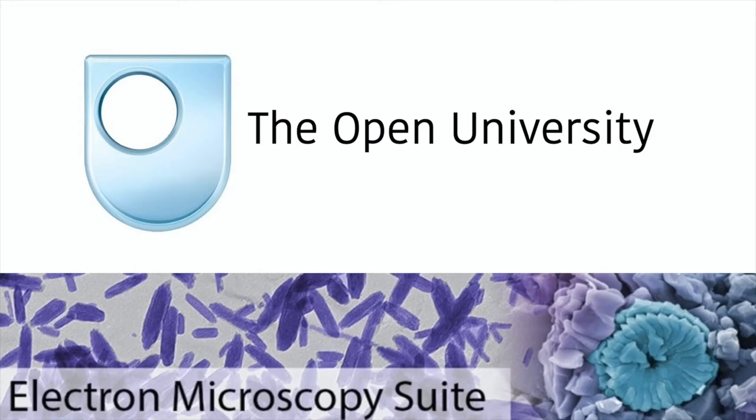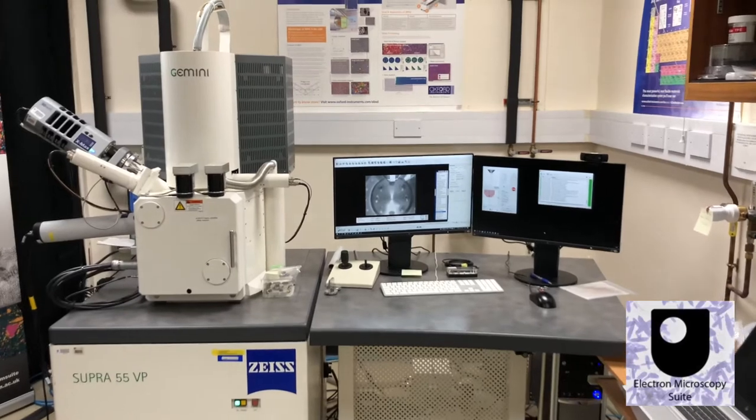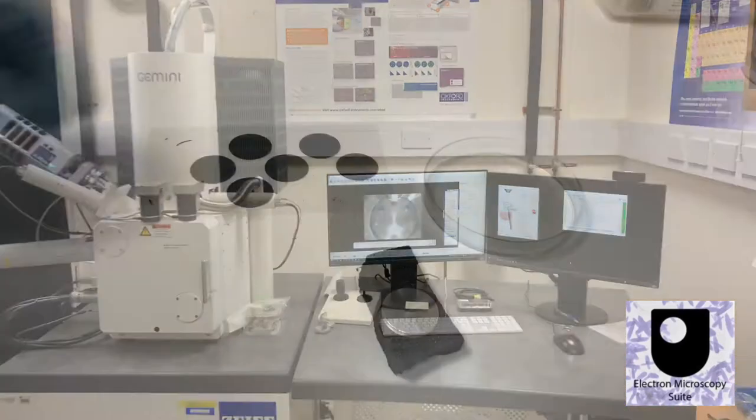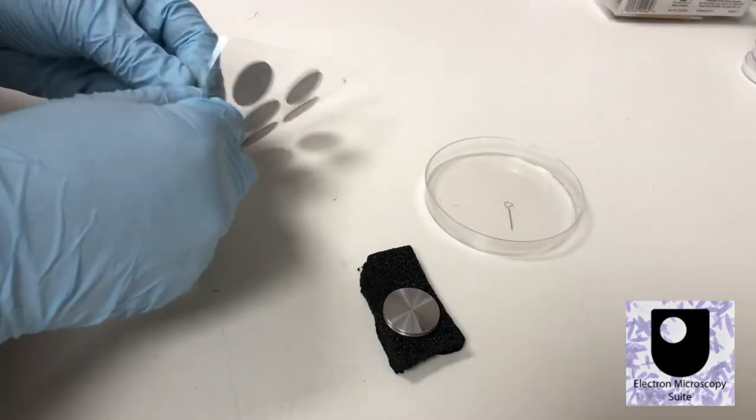The electron microscope is a floor-standing instrument consisting of a vacuum chamber, electron gun, and various detectors.